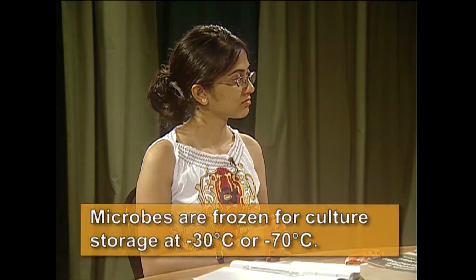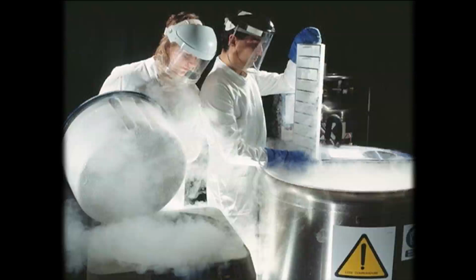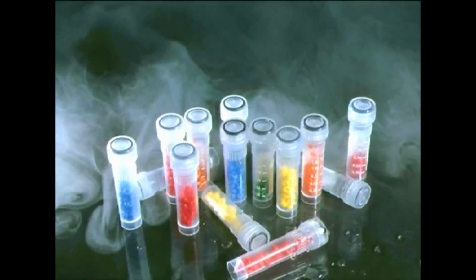Many times we prefer to restrict the growth of microorganisms by freezing or by refrigeration. Here we are refrigerating at -30 or -70 degrees centigrade. These methods are used for maintenance of bacterial cultures. As the things are being frozen and water is being taken out from them, the cells stop replicating, they stop reproducing. But they are still viable. They are not completely killed.